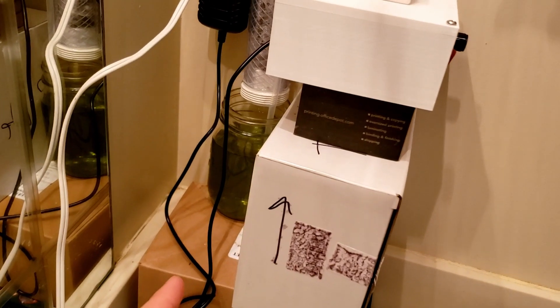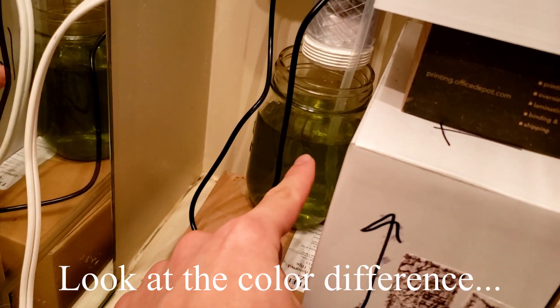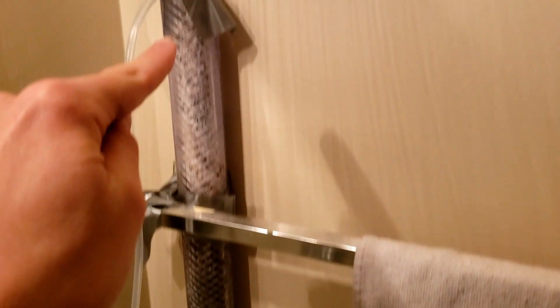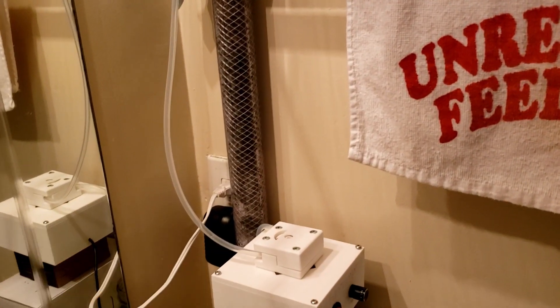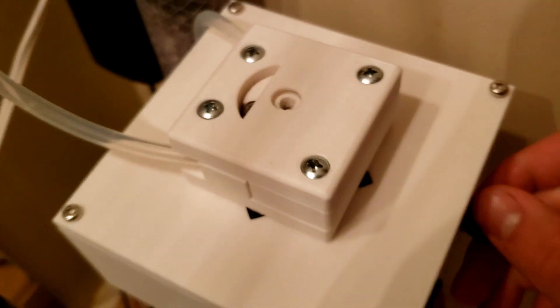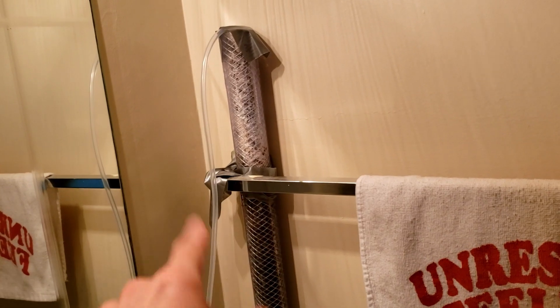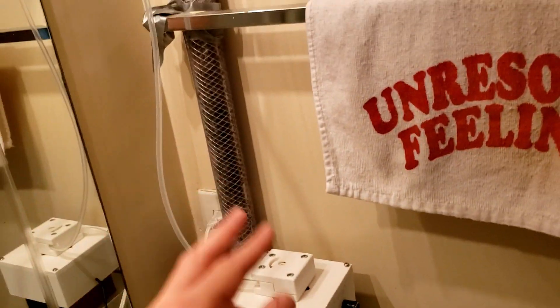Everything went fairly well. The feed rate was a lot faster than I wanted, so I ended up making it a recycle stream — pulling liquid from the bottom and putting it back in the top, just running it back through. I let it run for about 10 hours, let it rest, then ran another two or three hours, and the pump stopped working. I need to re-3D print one of the pieces — the inner spinny piece is spinning without spinning the outer one. I'm going to let this project rest for a little bit, see if the pleurotus grows through the tube or if it's contaminated. There's a lot of sources of contamination with the open jar, so we'll see.